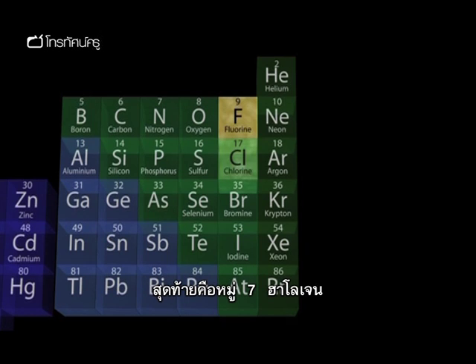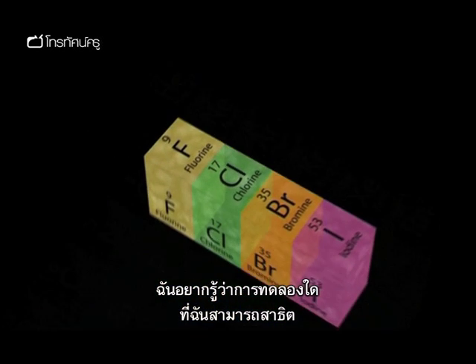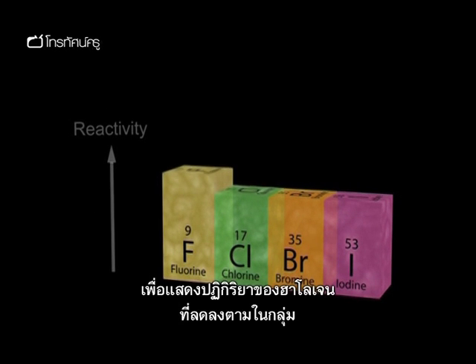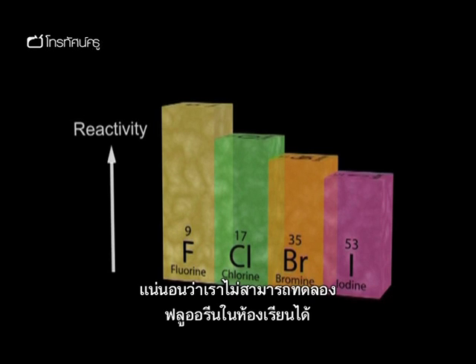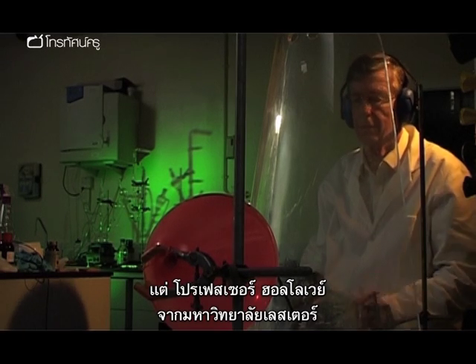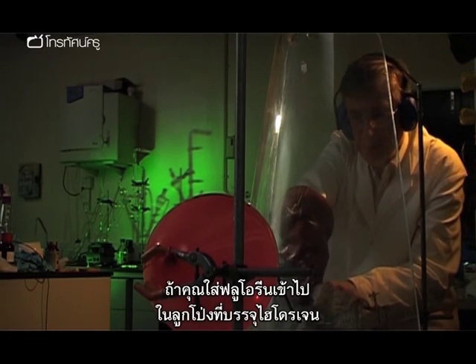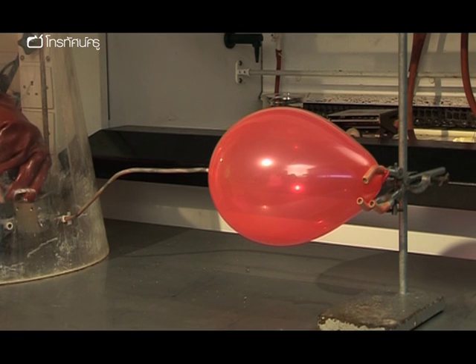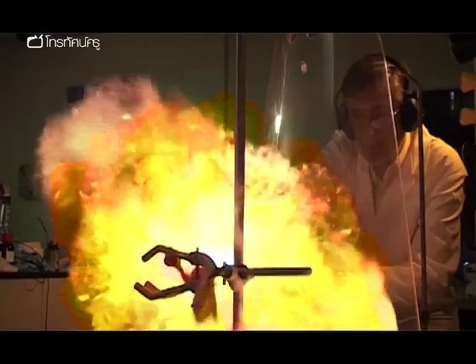Finally, there's group 7, the halogens. I wanted to know which experiments I could demonstrate to show that the reactivity of the halogens decreases down the group. Of course, fluorine is out of the question for class demonstration. But here's Professor Holloway from Leicester University to show what happens when you direct fluorine at a hydrogen balloon. Fluorine is in a cylinder and comes out of the nozzle.